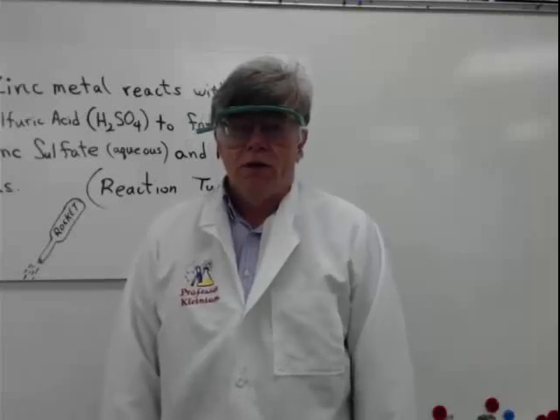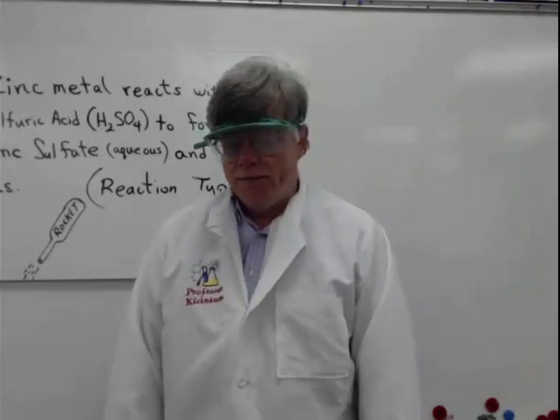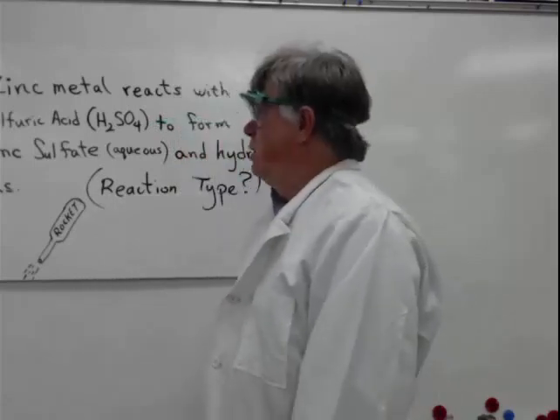Professor Kleinium here, explaining the little Pipet rocket lab we're doing in class at this time. And I want to start out by working through the chemistry of the lab.